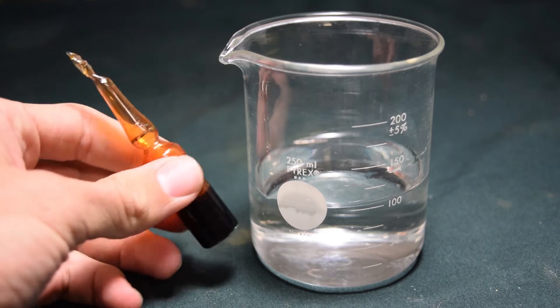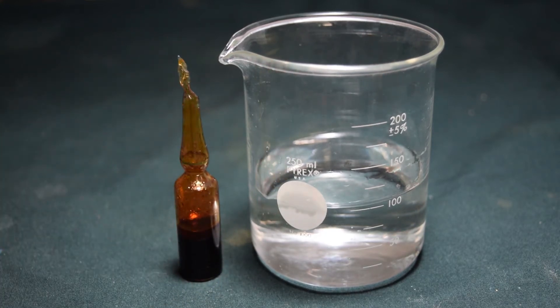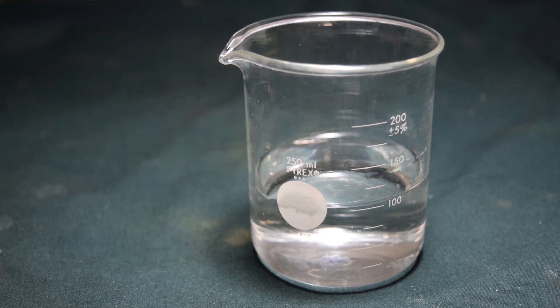Hey guys, this is GooferKingScience and today we will be making sodium hypobromite from bromine and sodium hydroxide. It's a bleaching agent, so we should be able to identify it easily.